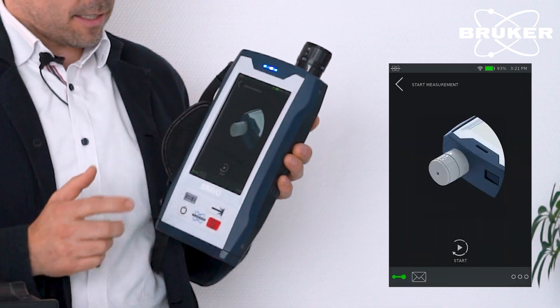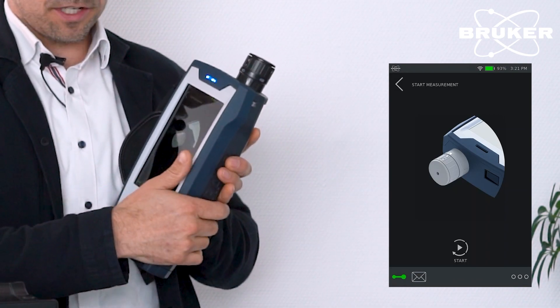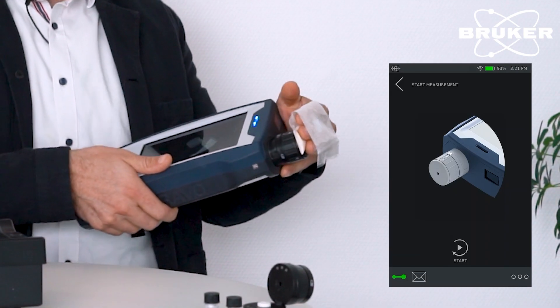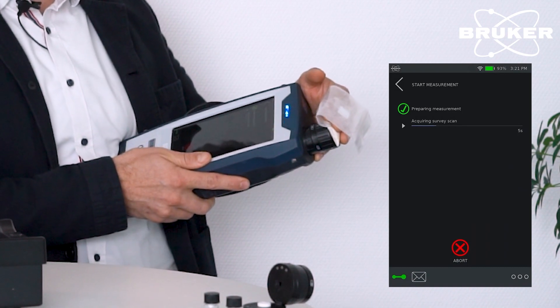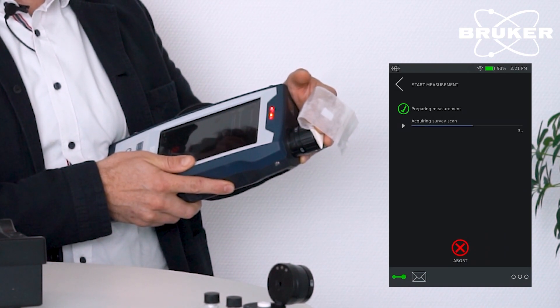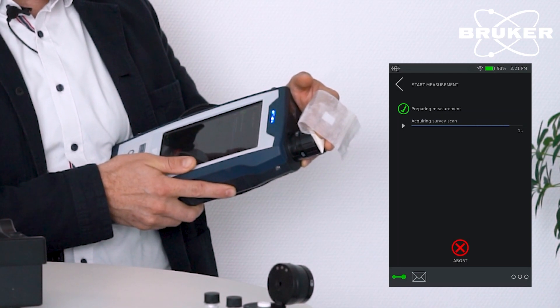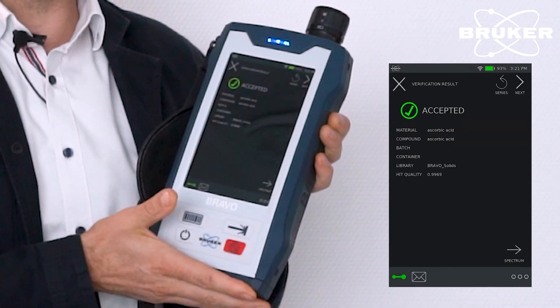Click next and the instrument will guide the user on which measurement tip shall be used. To perform the measurement, just press the sample against the tip and start. Everything is done fully automated. Depending on the sample type, a measurement takes approximately 10 to 30 seconds, and afterwards the analysis result is displayed — here: accepted.